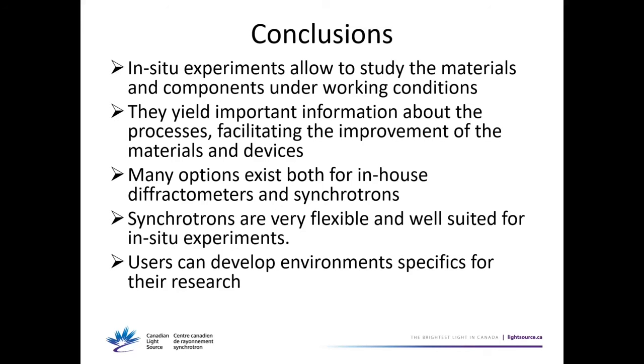So a regular absorption experiment could be like people come with a microporous material, let's say a metal organic framework, and you put it in a little capillary. First you heat it and pump it out, so you activate your metal organic framework, and then you come up with the gas of interest, let's say hydrogen, you let it in, and you can see how the structure of that material changes during absorption.